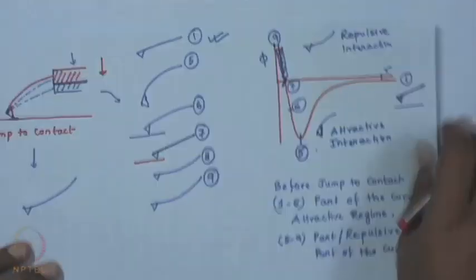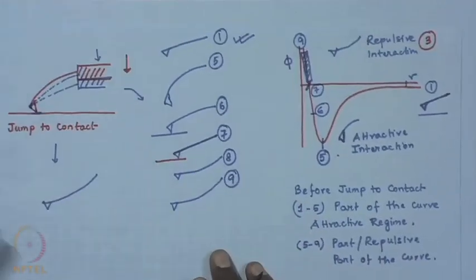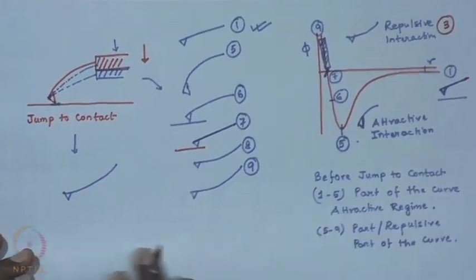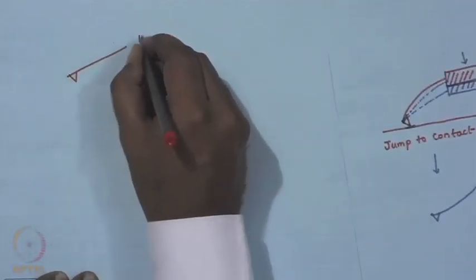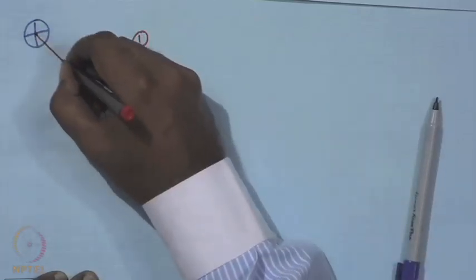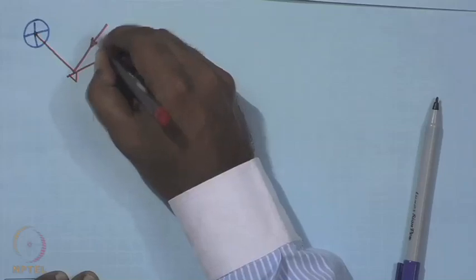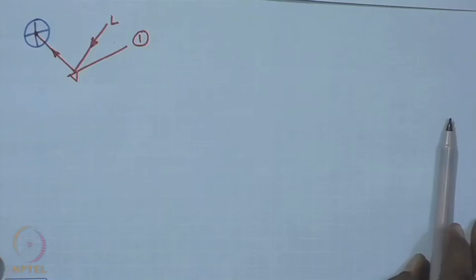So, what we need to now understand is how this deflection gets manifested on the photodiode. If you remember these configurations, one is a deflection-free configuration, and if you remember the sequence of alignment, let us say this is configuration 1 corresponding to the cantilever, and on the QPD or the PSD, your laser light is getting reflected. So this is the laser source, it gets reflected and falls at the center of the QPD.